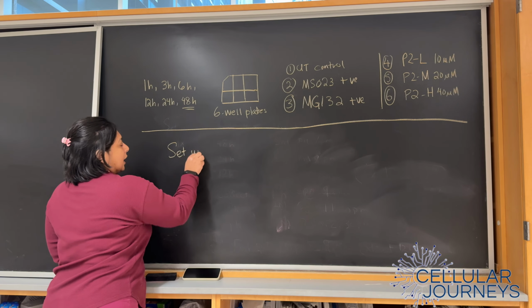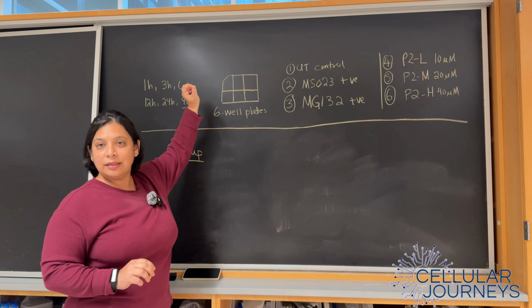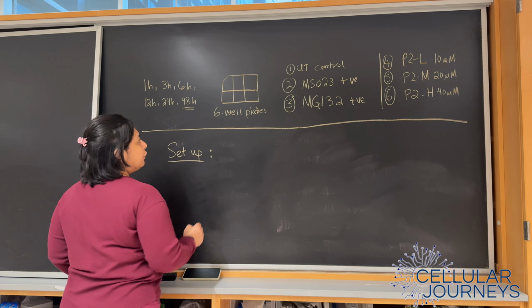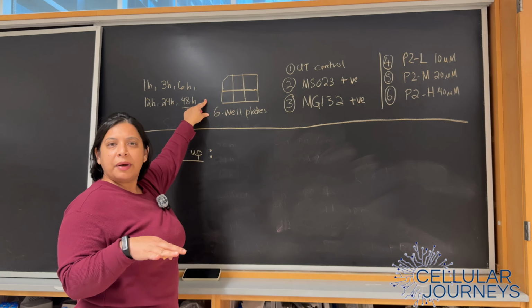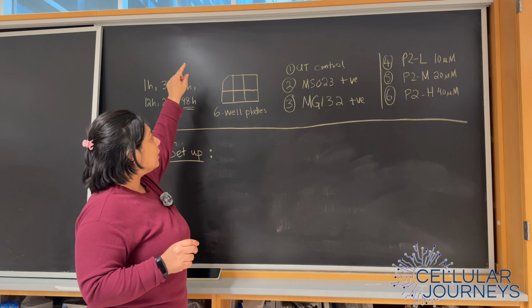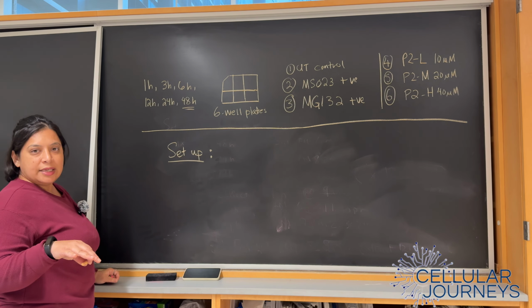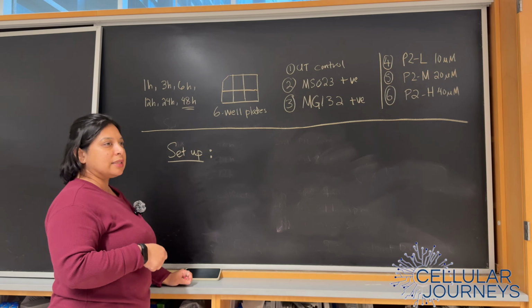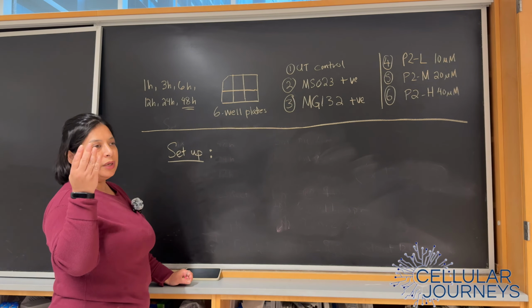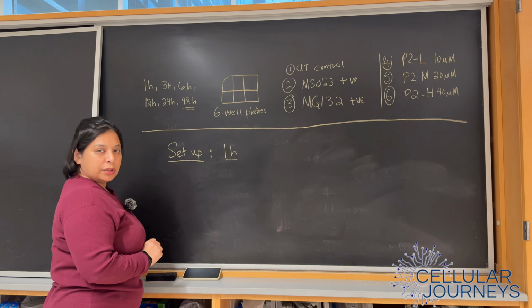So we know that we need time. It's going to need about an hour or so to set up our actual experimental plates and take the cultured cells and plate them for the experiment. The setup is fairly easy for this one because as long as we are getting about 40 to 60% confluence on our wells, we are good. The only important part is that all the plates should start off with the same number of cells. So that's a very, very easy setup to do. We don't need to worry about counting cells, calculating exact number of cells to plate, as long as we're plating, based on our experience, 40 to 60% confluence to start with. But that still needs about an hour on the first day.